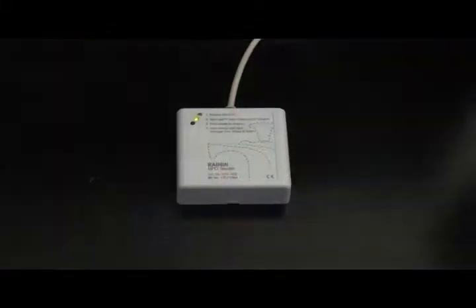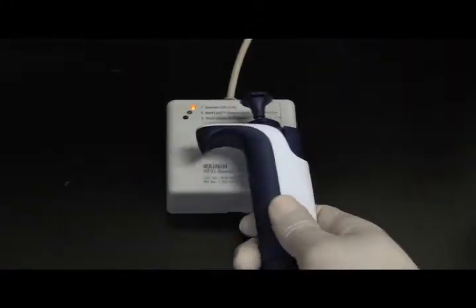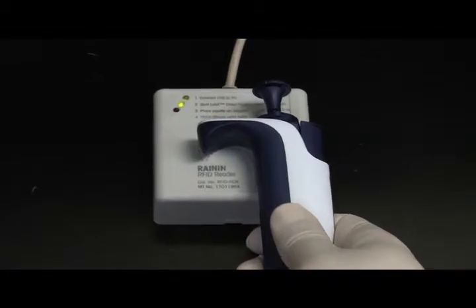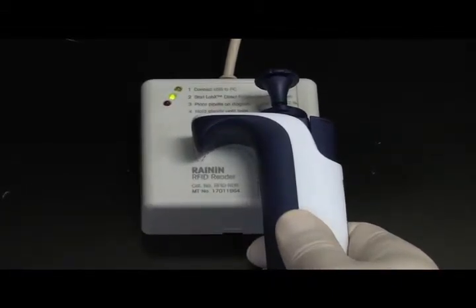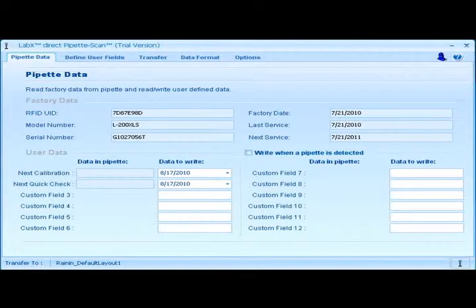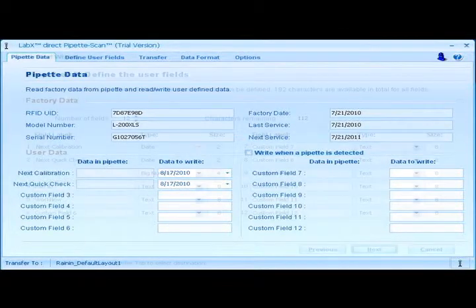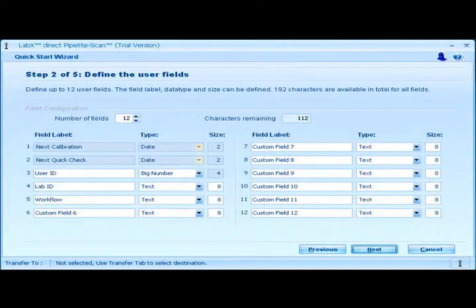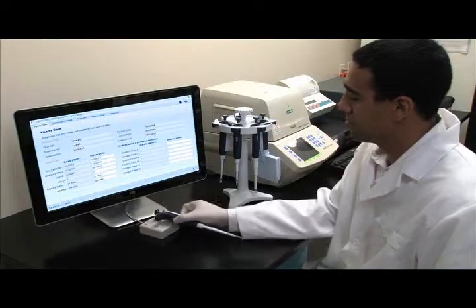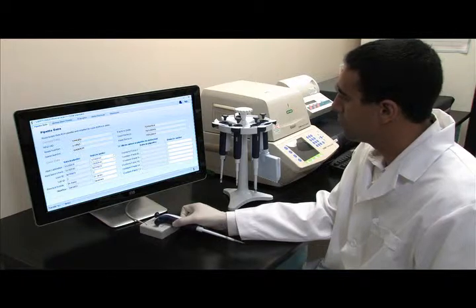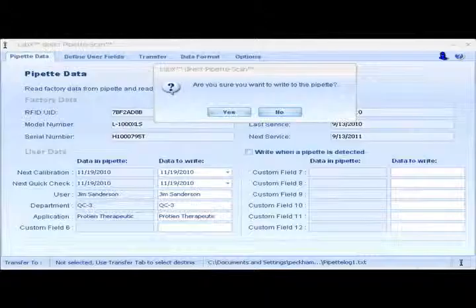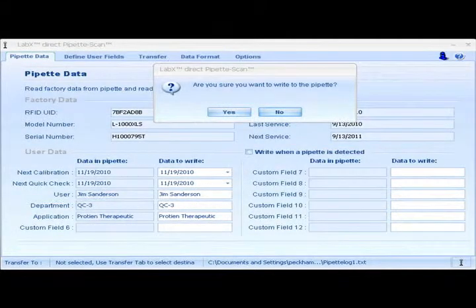Instantly view calibration and workflow data for any XLS pipette by scanning it with the RFID reader. With 12 customizable fields, LabX complements your workflow by tracking compliance and reporting attributes that are most important to you. To update the pipette's RFID tag, simply place it back on the RFID reader and click Write within the LabX application.